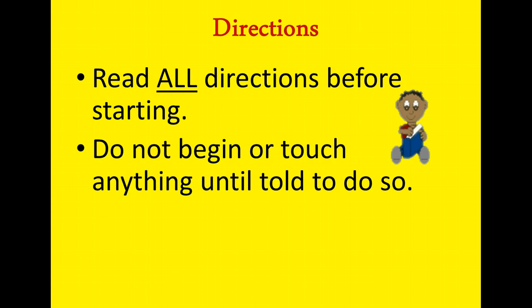Next, please do not begin or touch anything until told to do so. I will usually have labs set out ahead of time on the back counters, and I do not want you to go back there and start playing with things or looking to see what we're doing. So please don't begin or touch anything until I let you know it's okay to do so.